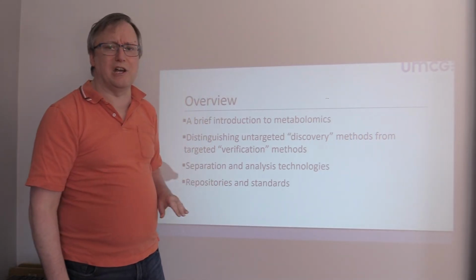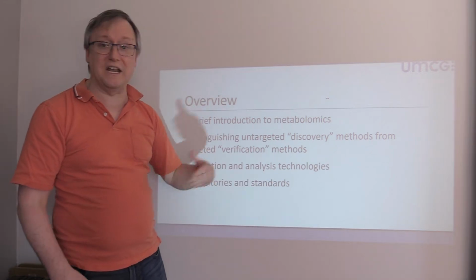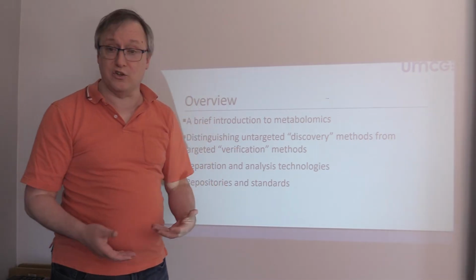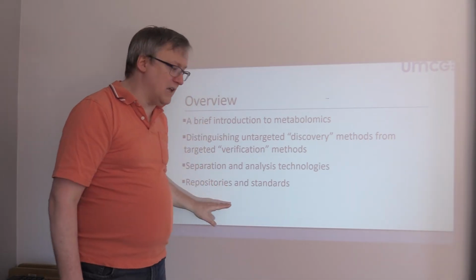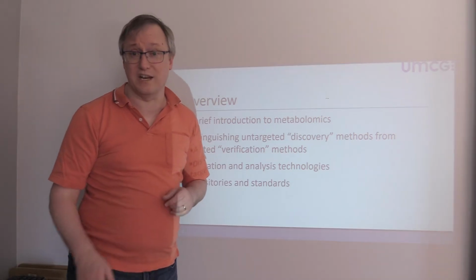And from there we need to talk a little bit about the different separation technologies that exist for it and what analysis technologies are used to produce the data for identification or quantitation. And at the very end of the talk I'd like to say just a little bit about repositories and standards.